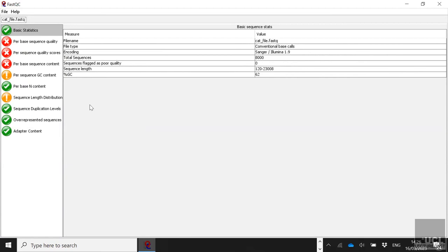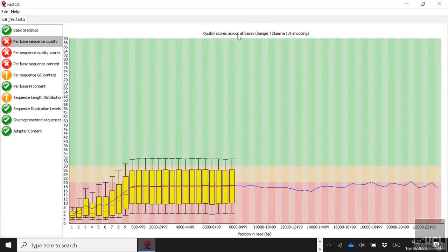You can see that it says here Sanger slash Illumina. So all of this information is put against what you should expect for Sanger or Illumina. Nanopore is obviously going to be slightly different, but we'll go through and explain that. In terms of basic statistics, that's the name of our file. You can see the total number of sequences that we've got is 8,000. The total number that were flagged as poor quality is zero. And the length of the DNA or the length of the reads is somewhere between 120 and 23,000. The GC content is 62%, so this is TB.